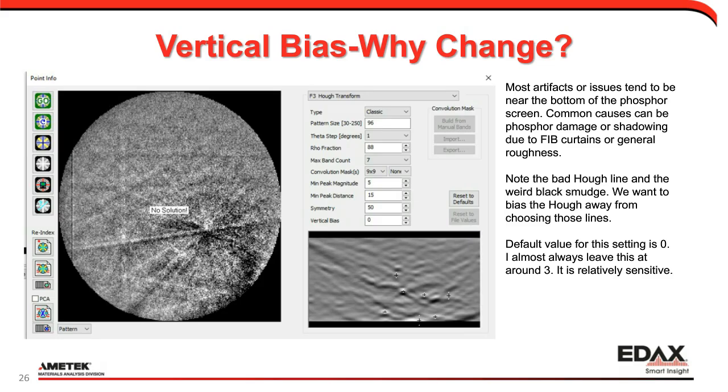In this case, what we could use, we call ours BMTs by default. I would start trying different micas in whatever database you can find. Go to the AMCSD, the American Mineralogist Crystal Structure Database. It will have a whole bunch of different micas, and just start going in there and saying, hey, what can we do, and go from there.